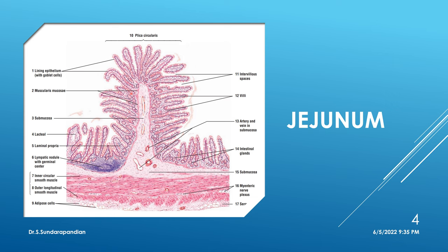Similar to duodenum, here also you are able to make out villi — these are the surface projections of mucosa in jejunum. In between the columnar cells you are able to make out more numbers of goblet cells compared to duodenum. In the lamina propria you can sometimes make out lymphatic nodules. This larger projection is the plica circularis, which is why you can see the submucosa within it.